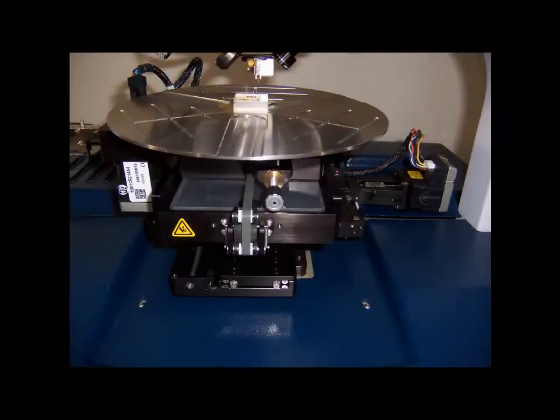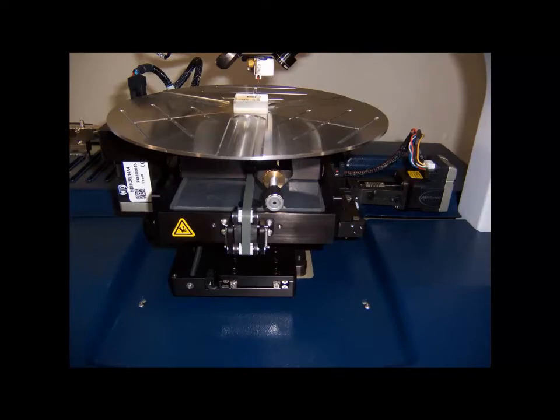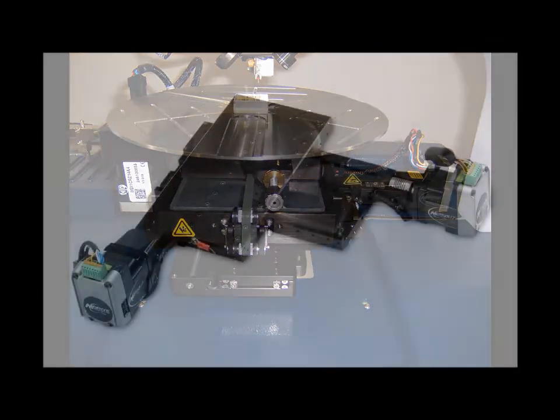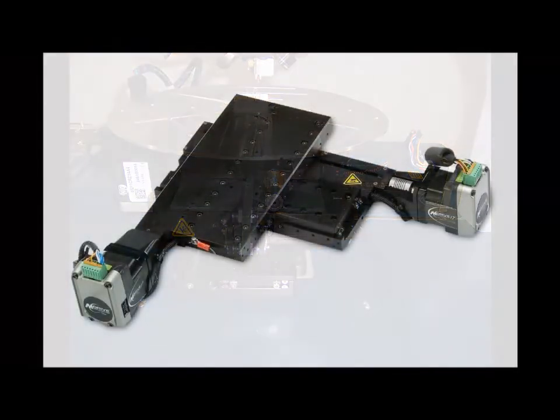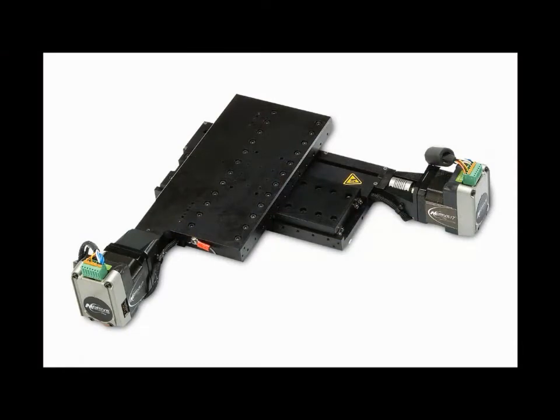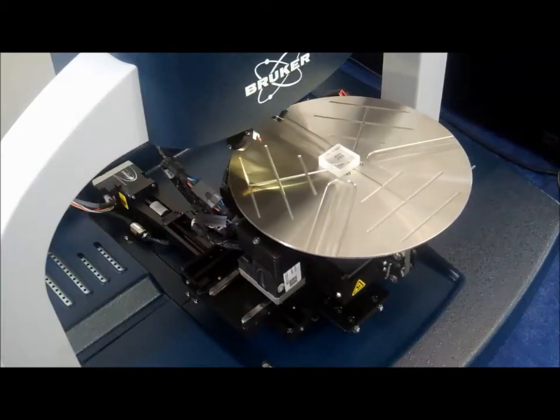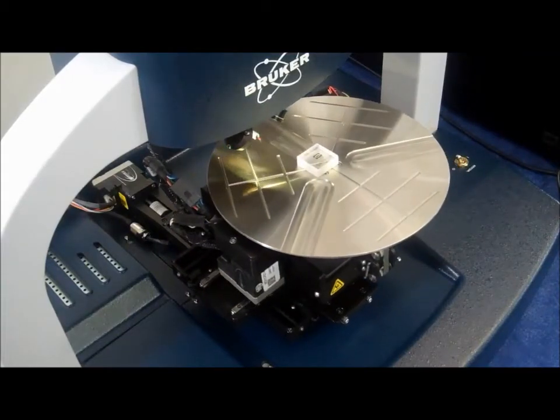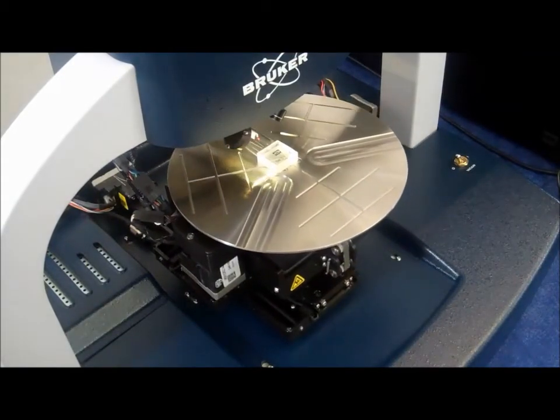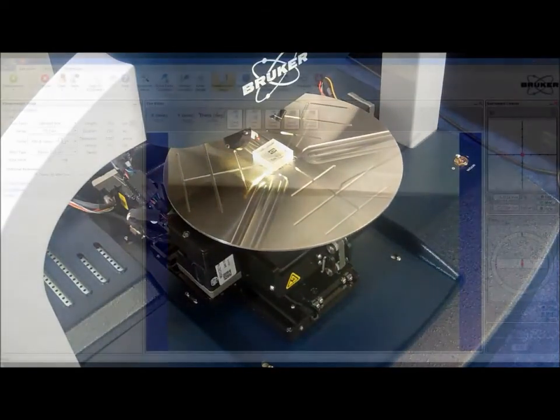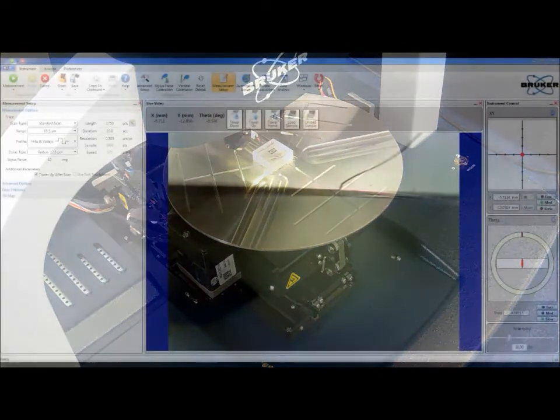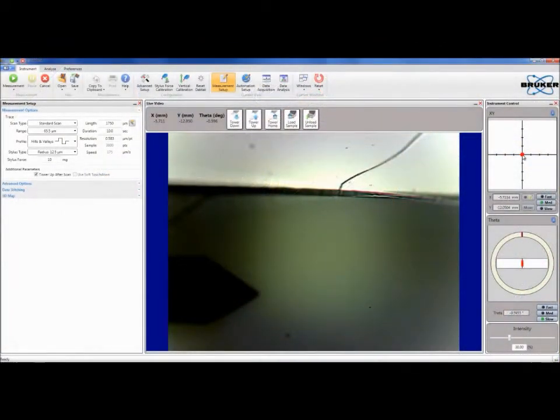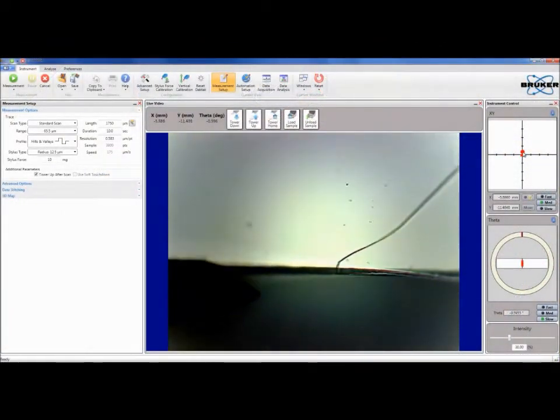The optional DECTAC configuration includes a 150 mm automated and programmable XY positioning stage. The automated stage can add 3D mapping and stitching capabilities to the system. It also permits the system operator to log and measure multiple sample locations serially. The stage positioning is controlled directly from the Vision 64 software interface.